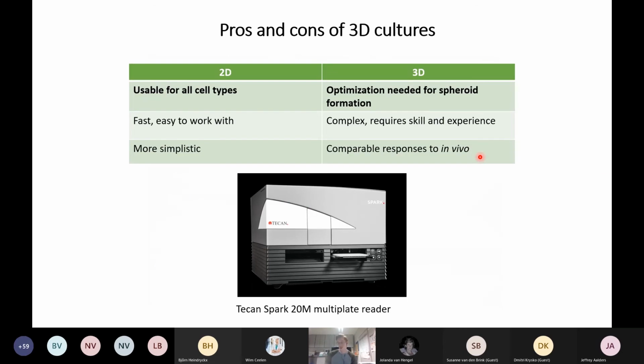The issue with ferroptosis and cell death in general is that mainly 2D cultures are used for their analysis. 2D cultures are mainly used because they are easy to work with, whereas 3D cultures are more representative for the in vivo situation. But 3D cultures often require sectioning for their analysis or disaggregation into a single cell suspension. These processes are quite labor-intensive and time-consuming. Therefore, we wanted to find an easier assay to analyze cell death in 3D cultures.